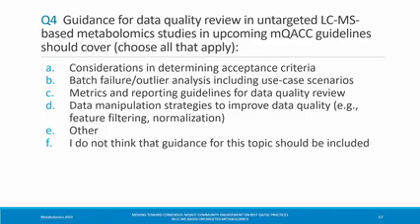So we start training our colleague who owns or will be running a big cohort, while they are collecting samples, working on either plasma or serum, they should start to make a pool sample, so that if they worry about the freeze-thaw cycle, that's the point where they can make multiple QC aliquots, for not only metabolomic study, but for all kinds of study, because that's the way we can make sure that inter-batch variation can be considered. All right, excellent, thank you.